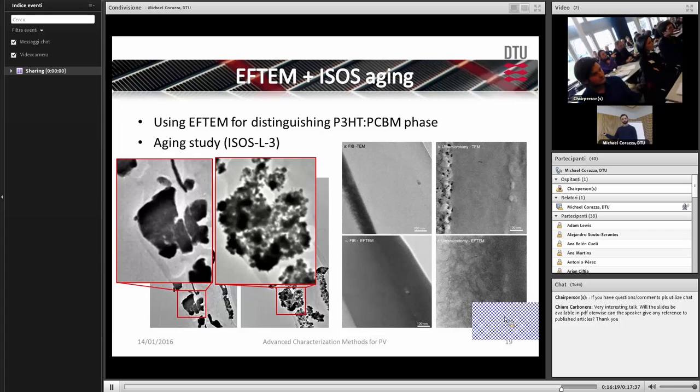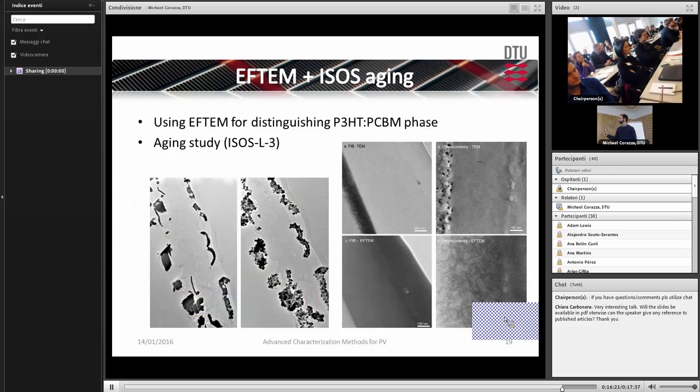Yeah, you look at this one or before? That one, yes. This is ultramicrotomy. Yeah, sorry. Yeah, good question.